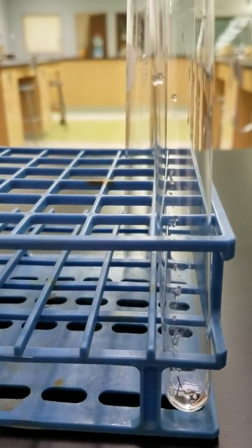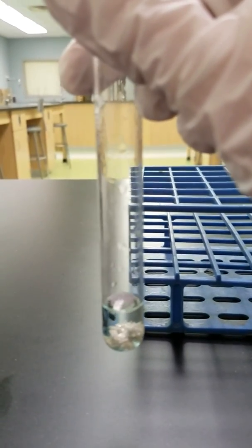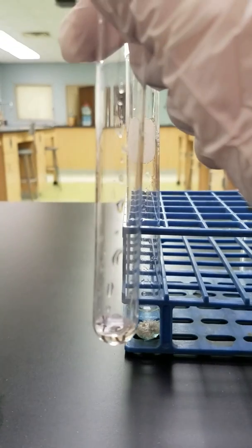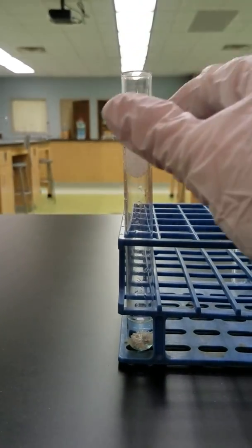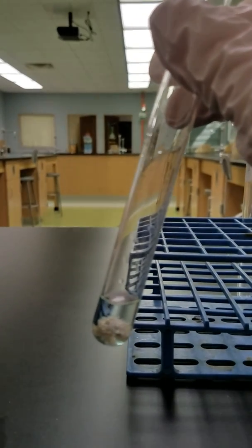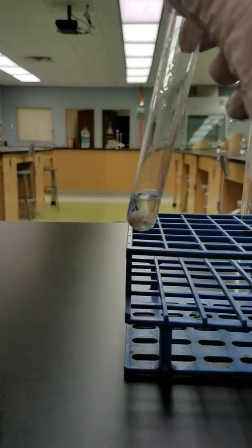Now here's one that's been sitting for a few minutes so we can see what it looks like. And you notice we have a big difference from how it looked initially, right? Here's what it looks like after about 5 minutes, and here's what we had immediately upon mixing. The reaction hasn't occurred yet in this one, and after a few minutes we see a large difference. And what we're actually seeing here is silver metal. That cloudy, kind of foggy looking substance is actually silver metal.